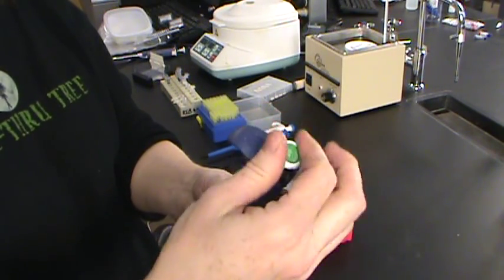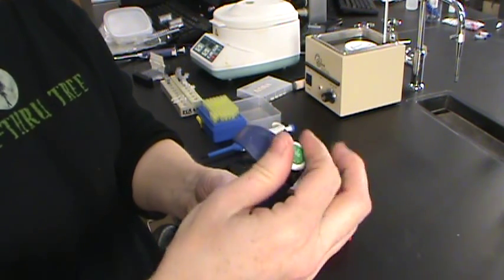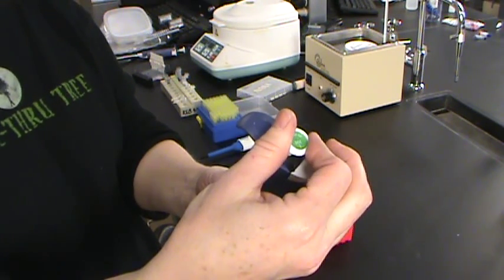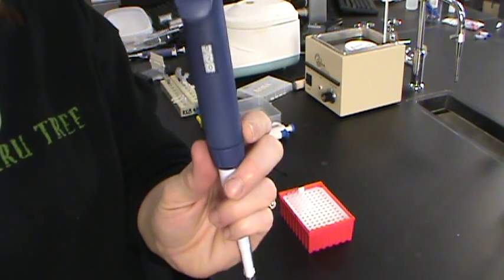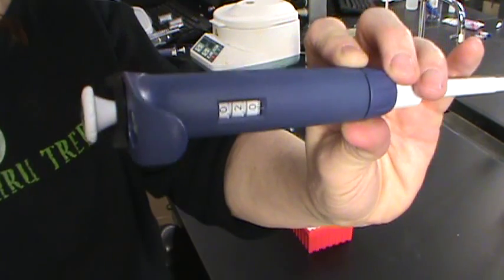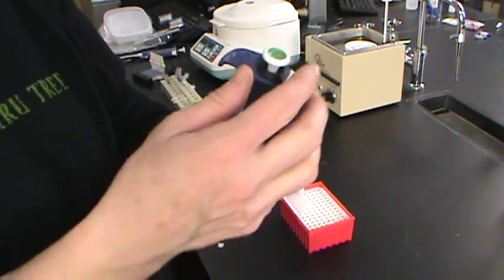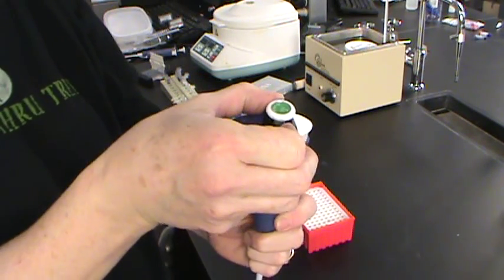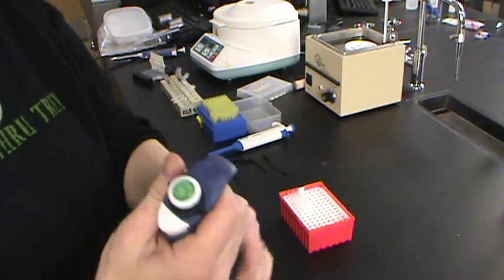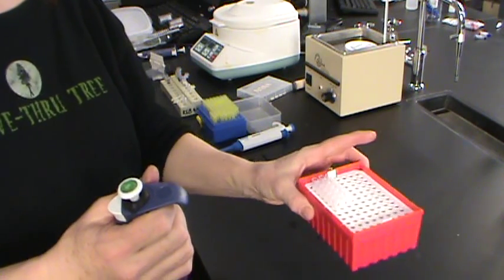And as I said, this will do a maximum of 200. It actually will measure volumes between 20 and 200 quite accurately. So we can look at this and we can see that it says 200 there. A little difficult to see. Then we'll turn the knob on top here so that kind of holds the plunger in place. Now we have the pipette tips, and we'll have some of them in boxes like this.